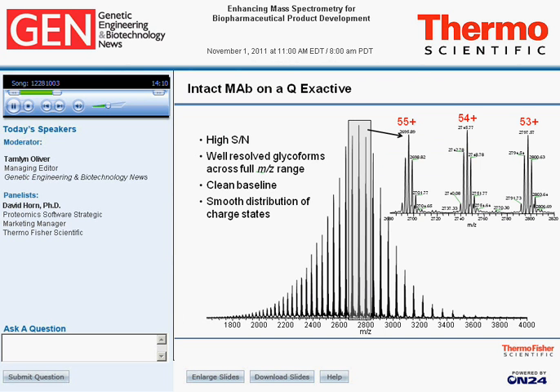And again, like I had mentioned before, if you look at any one of the individual charge states themselves, it almost looks like a deconvolved spectrum. The peaks are so well shaped and they're so clean. Now, this was not a lucky shot at it. We actually have looked at many, many data files now of antibodies of various masses and sizes on the Q Exactive, and almost all the spectra that I've seen for these antibodies look just like this.